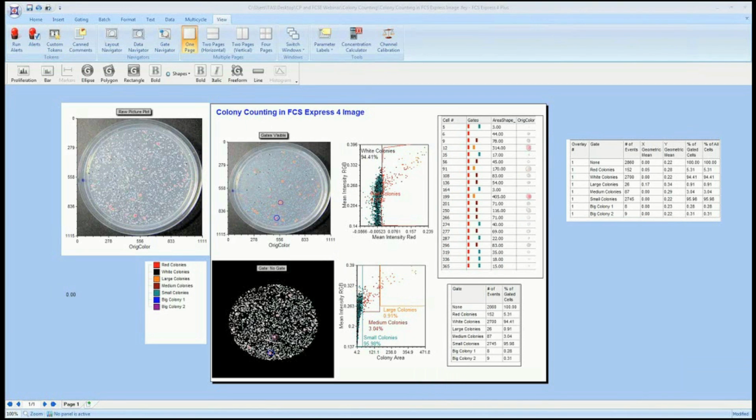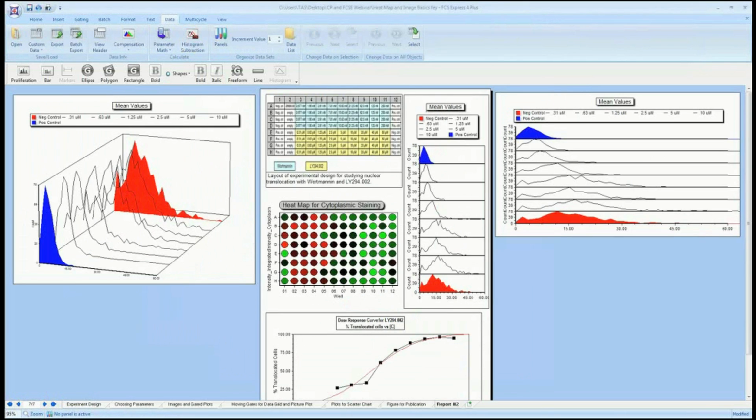Okay, great. And I see here in the list of questions a general trend towards curiosity about other image formats that we're compatible with. I just want to address that by saying we maintain information on our website as we formally announce image format compatibility. Most of you are familiar with CellProfiler. A lot of our registrants today came through the use of CellProfiler. So you know that hundreds of image formats can be read into CellProfiler, so that's quite a gateway to bringing data into FCS Express.